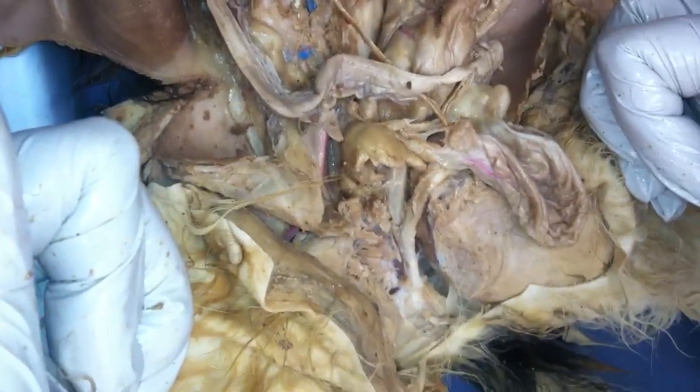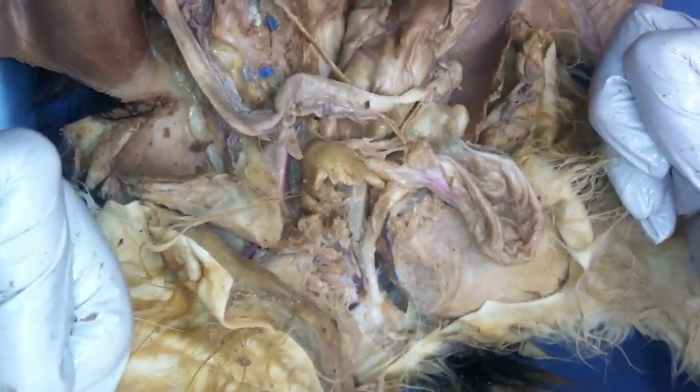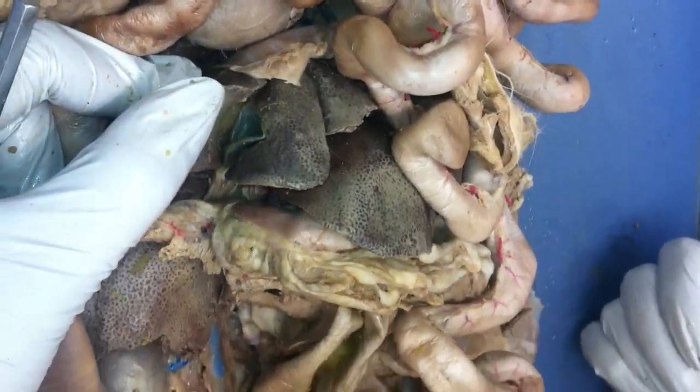Yeah, cut it. I think that's it. Oh, there's a couple of things I forgot. The mesenteries, I forgot the mesenteries. I forgot the gallbladder, which is right there. I think that's about it.